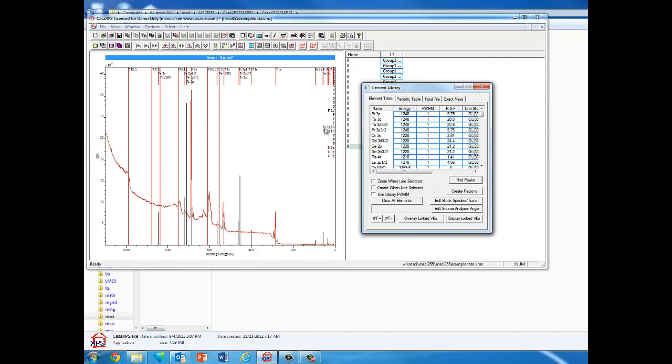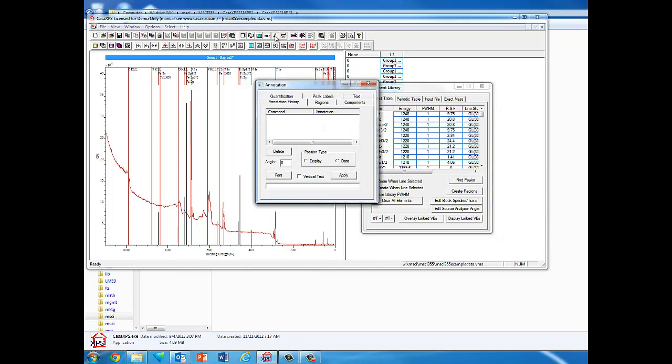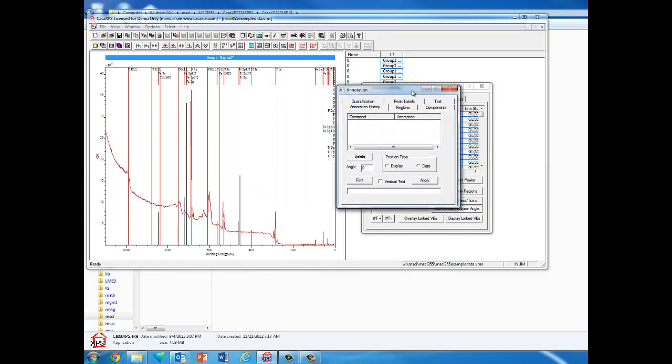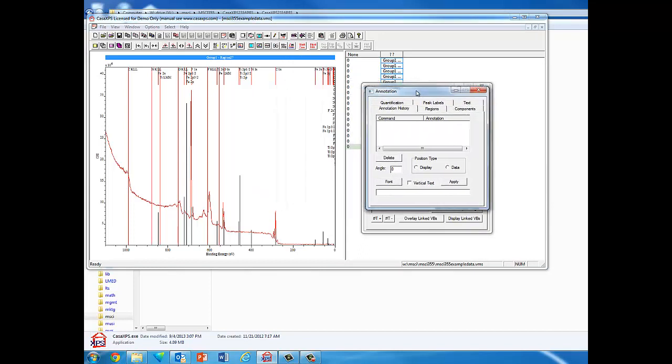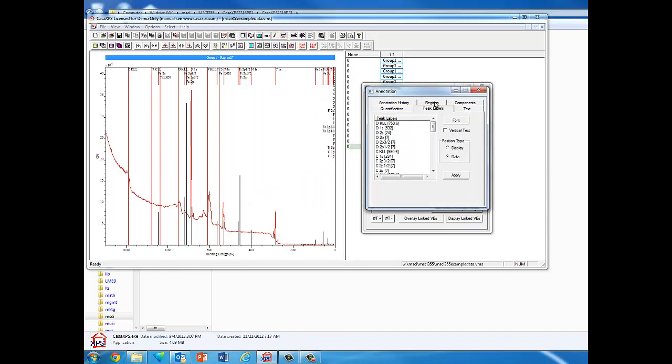We can change the labels on the graph. To do that, we go up here and select the pencil icon. Let me move this over so it's out of the way. If we do Peak Labels, it has all the different peaks it found in the peak identification process.